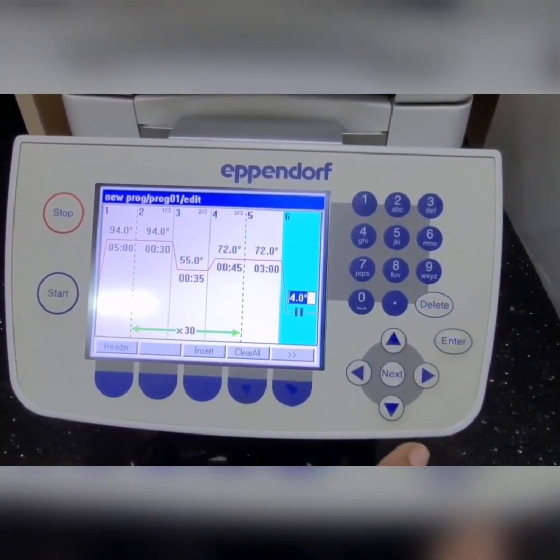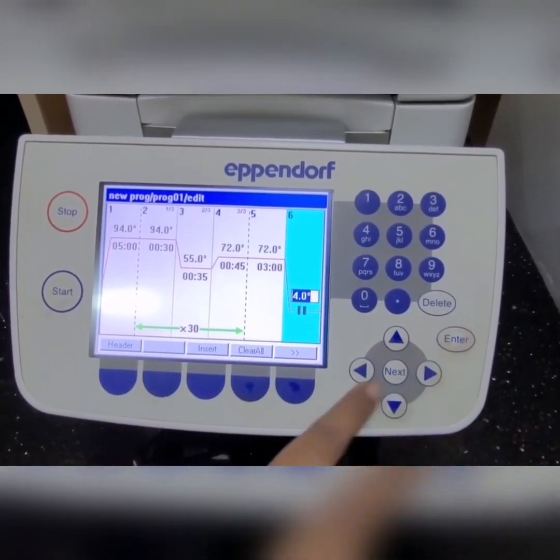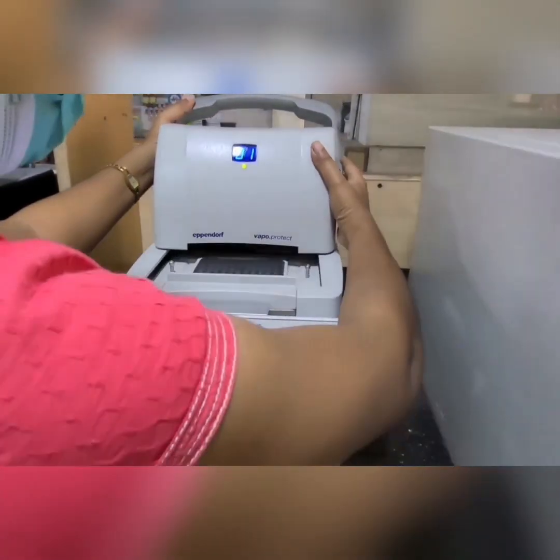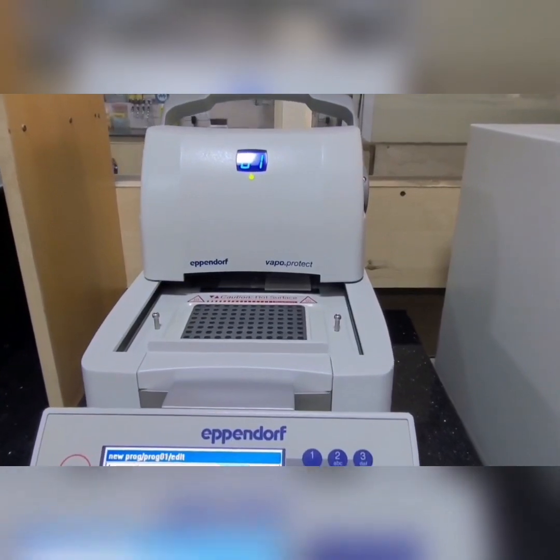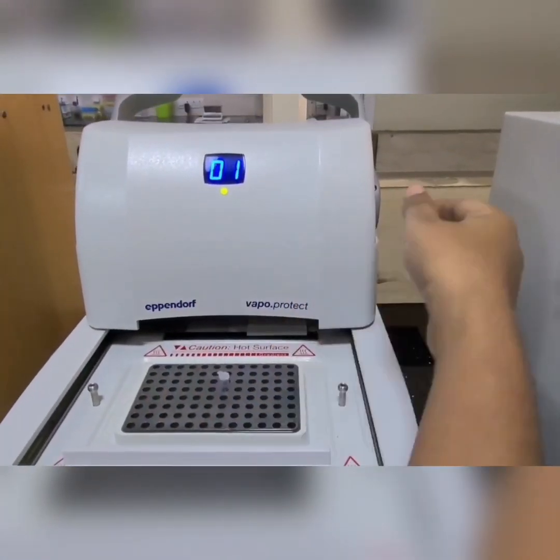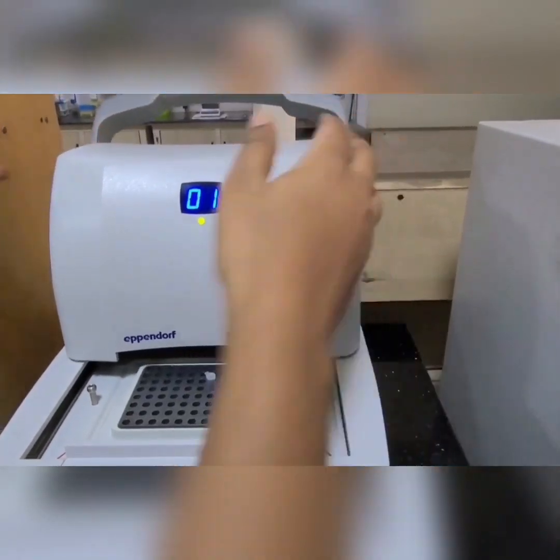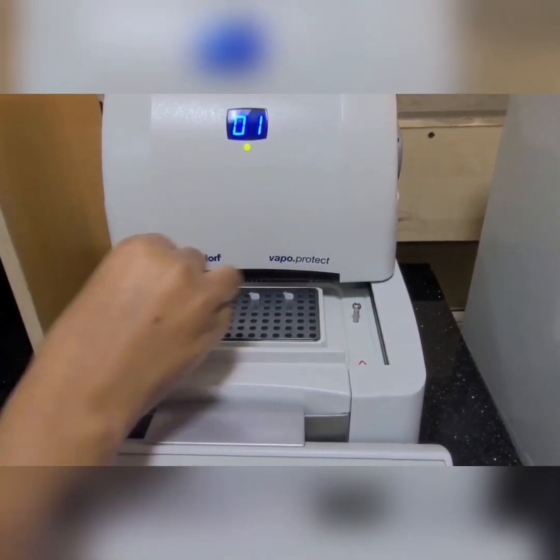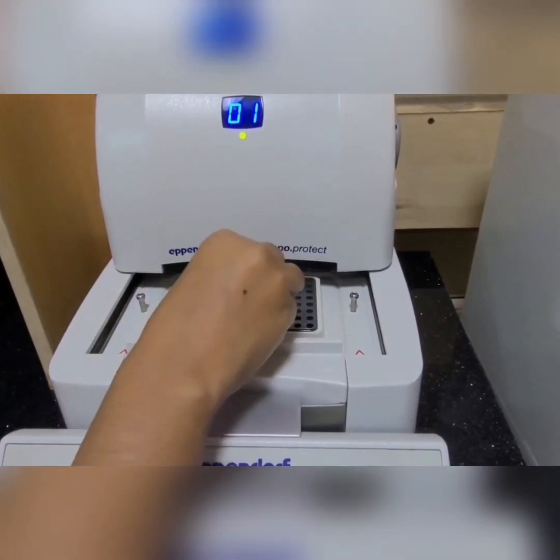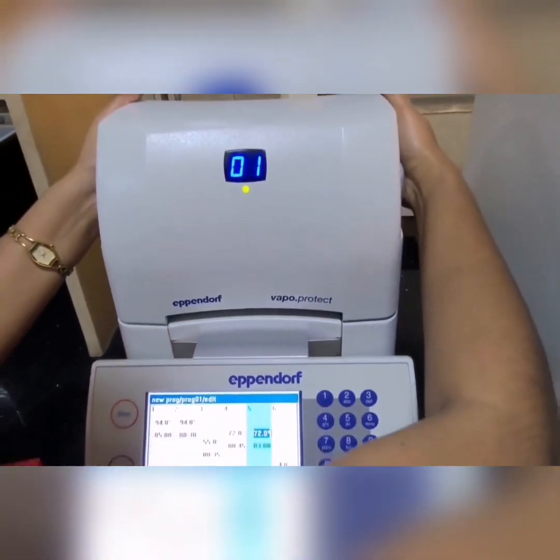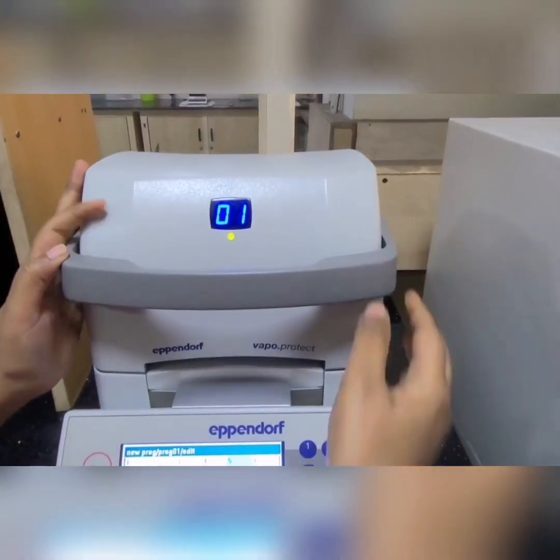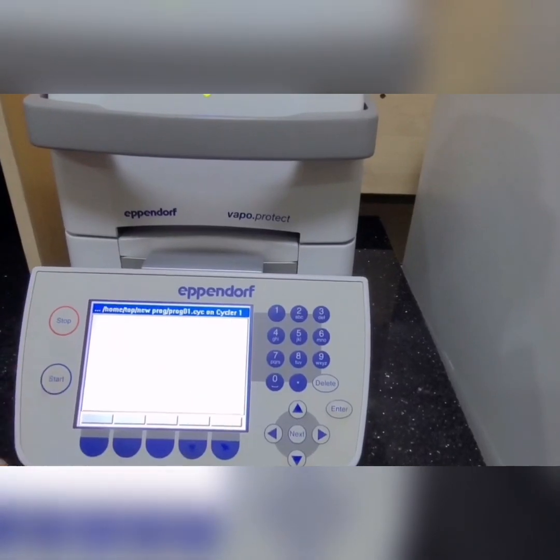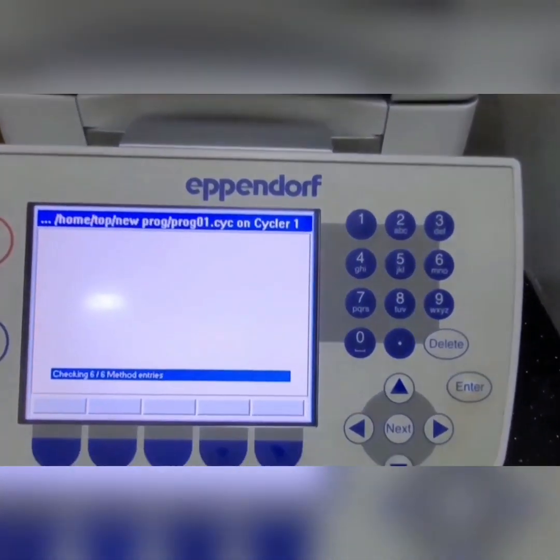The final step is set to 4 degrees. After this you can open the lid and place your tubes on the block. We usually use only 0.2 ml PCR tubes for this. The block has 96 wells — place your labeled tubes and then close the lid. There is an indicator green light displayed; if it is red that means you have not closed the lid properly or have not placed your tubes correctly. Then press the start button to begin your program.